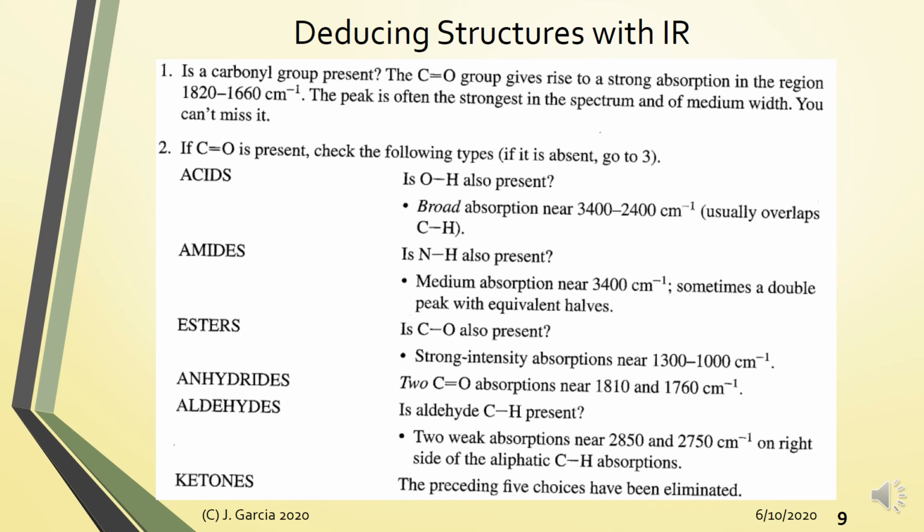So normally for the board exam, they will just give you the IR spectrum of a pure organic compound, no? So mas lesser yung complexity ng problem, no, compared to real world problems, no, wherein normally you analyze mixtures. Pag mixtures ang ina-analyze sa real world, sa work scenario, normally what you do is you just compare it with the standard products. So kunwari, issue on counterfeiting ng paint products, for example.